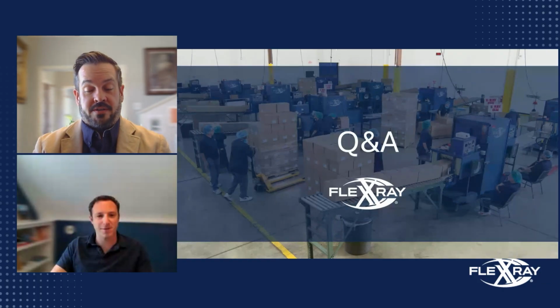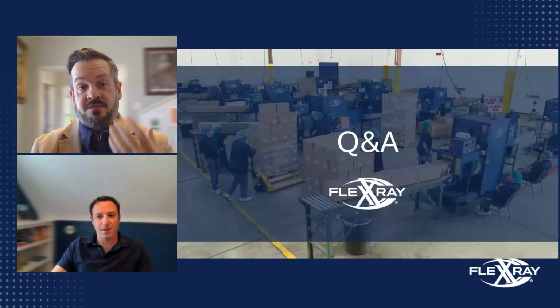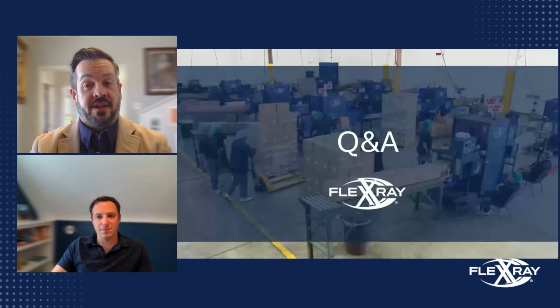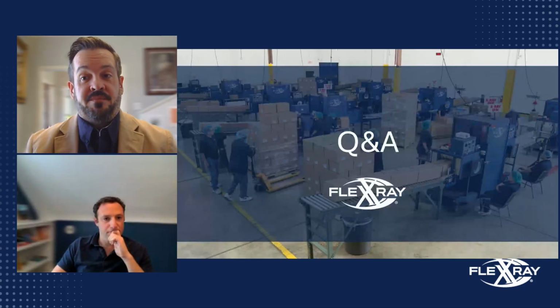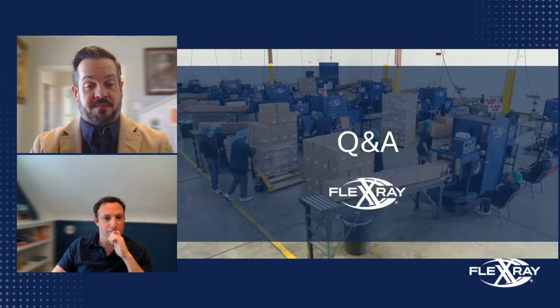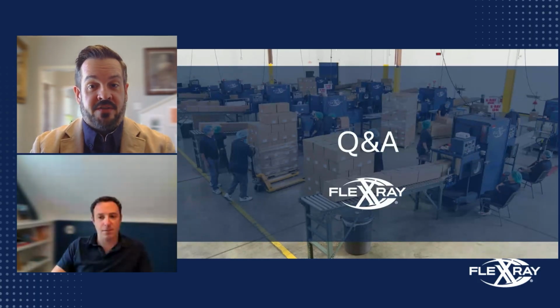That's a good question, and I'll try to answer as quickly as I can. Everything that we receive as far as a foreign material and product combination, we're going to image on a 2D imaging device. We have more of those available on our network, and we just want to establish detectability in the quickest way possible. So if something is detectable in our 2D setting, we're also going to leverage CT technology whenever we have open capacity.